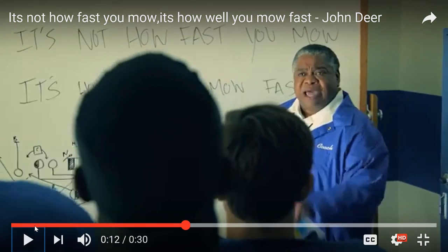So this commercial is actually about data independent acquisition. What these wonderful men and women are trying to tell us is it's not how fast you acquire spectra, it's how well you acquire spectra fast. So you could scan on the QEHF at 20 hertz. The problem is those are going to be kind of crummy spectra. Okay, so that's your hint.